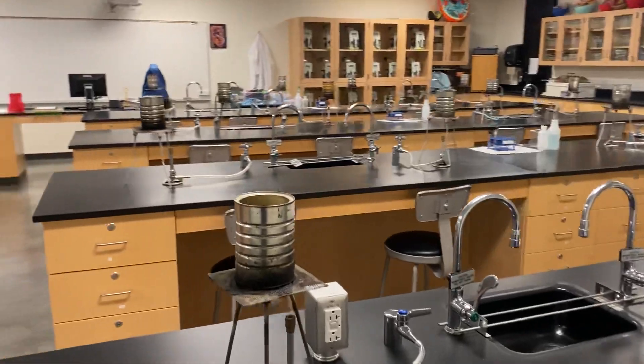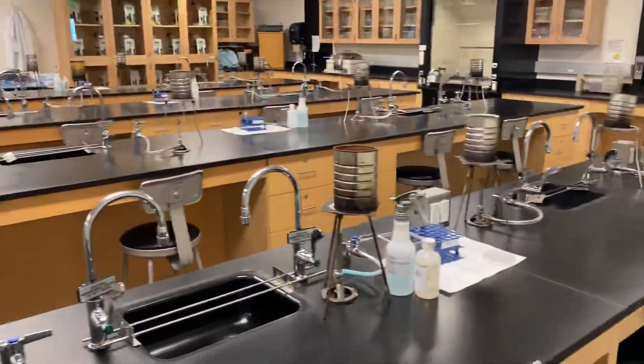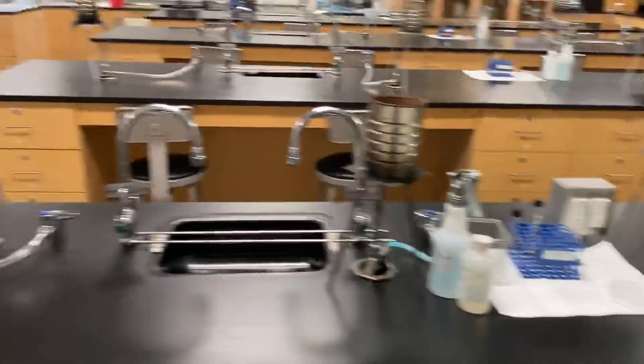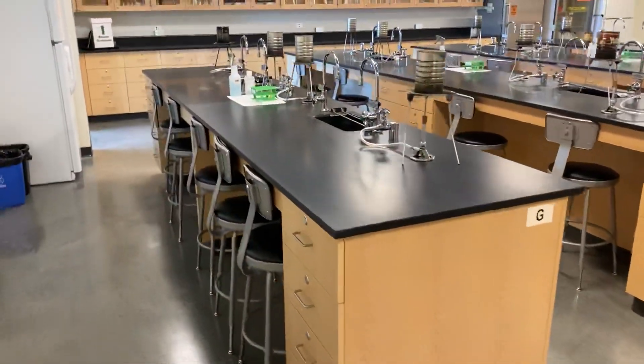We already have tripods, gauzes, and cans set up for you. Each bench will have one setup per student that will be exchanged roughly every hour and a half.